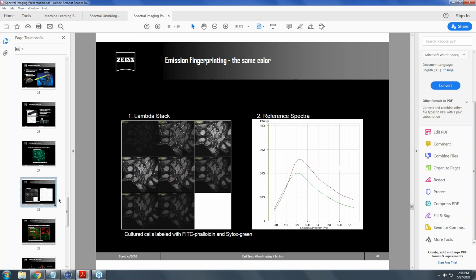But when you actually look at the shape of the curves, the shape of the curve looks different for the two. And so what you really want when you're doing spectral unmixing, and this is why doing plants, the one saving grace of doing plants, if you do chlorophyll, chlorophyll is a very broad shoulder on the emission into the red.